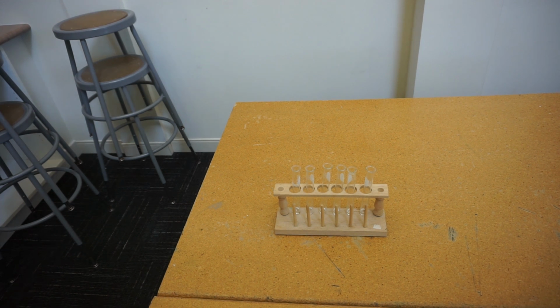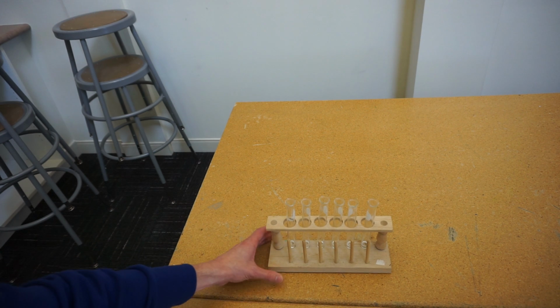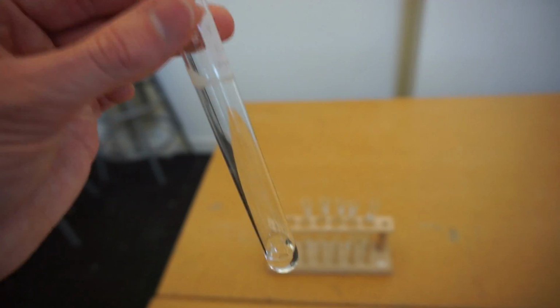So we'll start with methanol. And we should be able to see a nice clear solution showing that we're getting a good mixing between water and methanol.